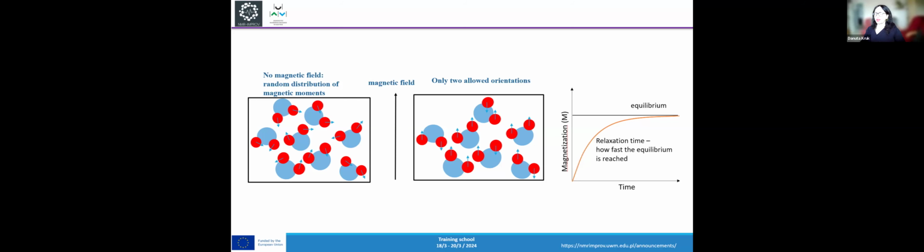Let's put it in this way. Or maybe the word macroscopic is not right. It's a magnetic moment which can be detected in NMR experiments. And the magnetic moment stems from the difference between the populations of the lower and higher energy states. This effective magnetic moment is called magnetization. So you know what is happening.